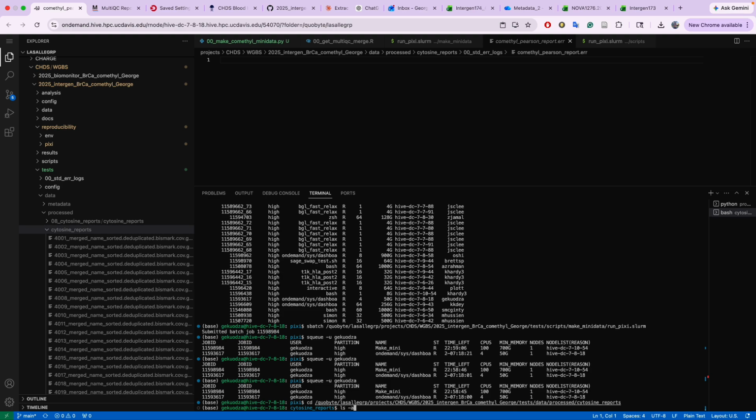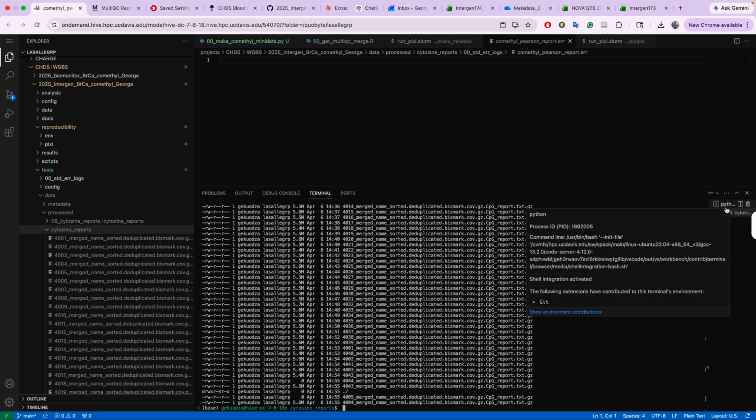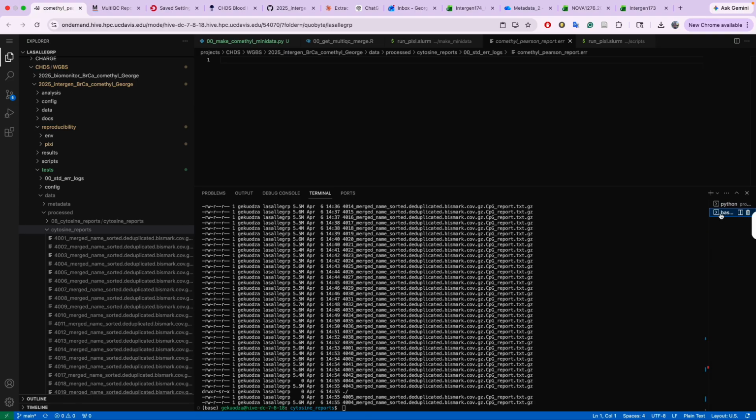And then we're gonna do an ls -alt on it. Okay, so this is supposed to be on job 43, and that's the one that was just made now.